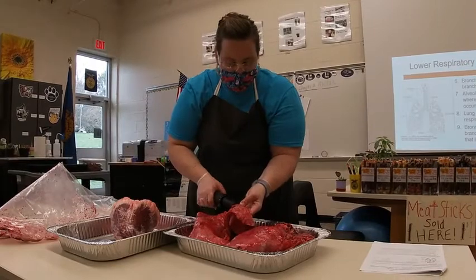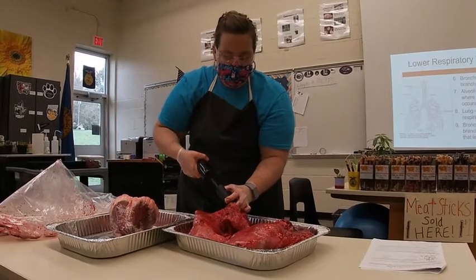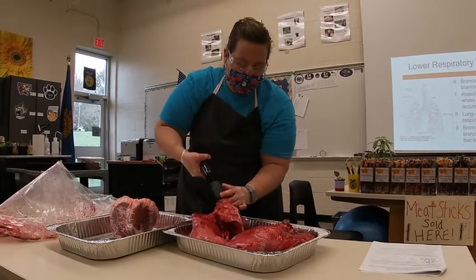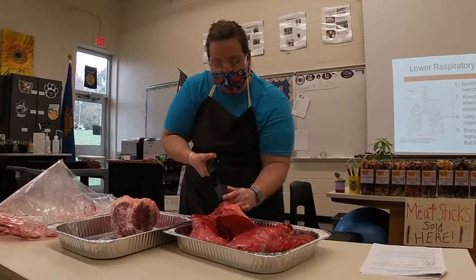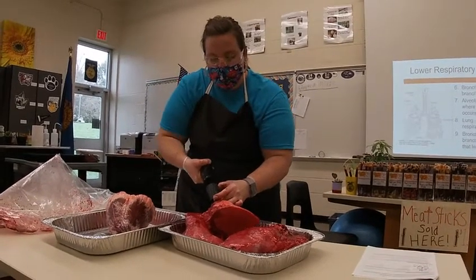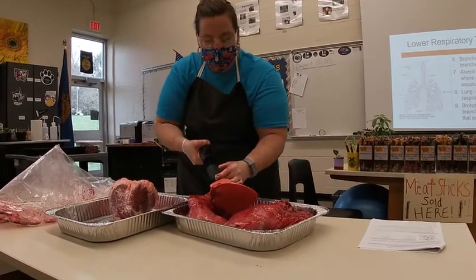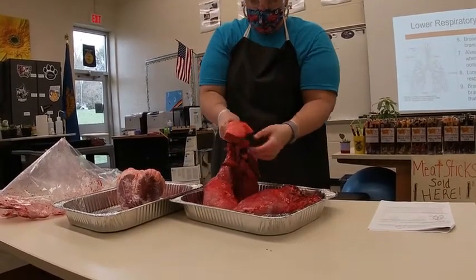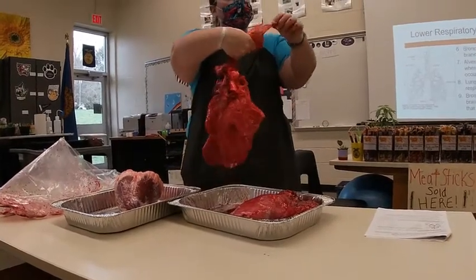I've inserted it — let's see if I can do this myself. I don't know if you can see from where you're at, but every time I put more air in, the lung is expanding and getting bigger. I just inflated it. You can see it got lighter in color.